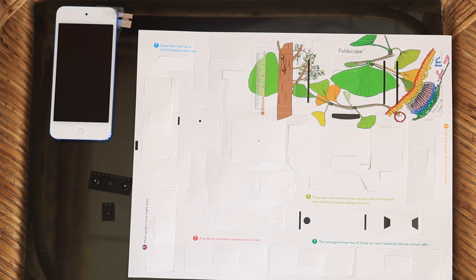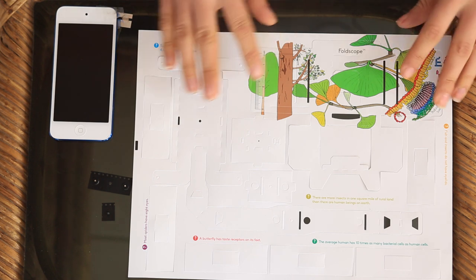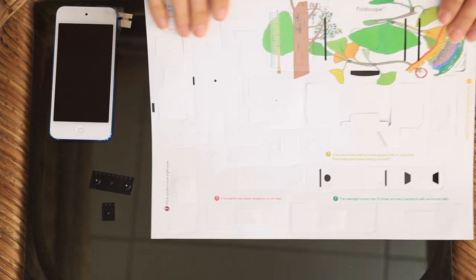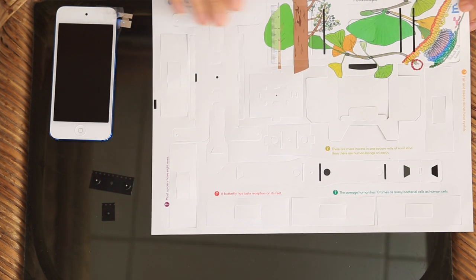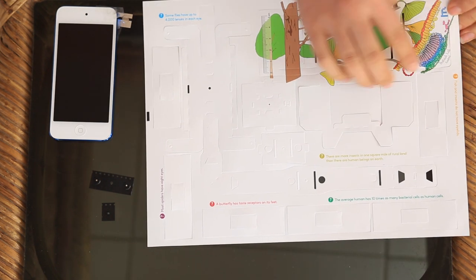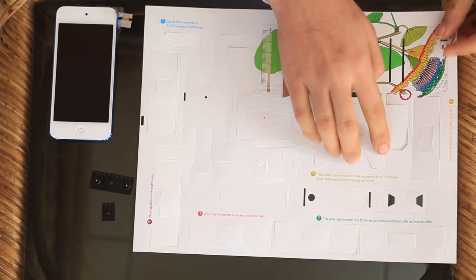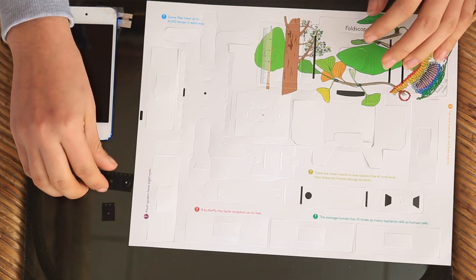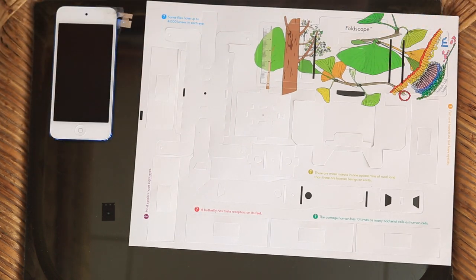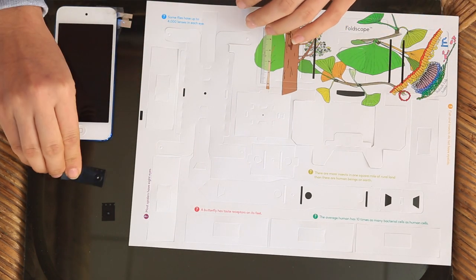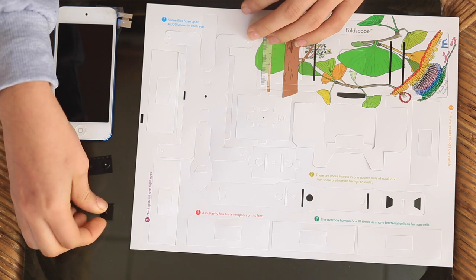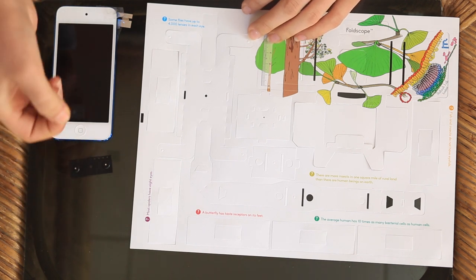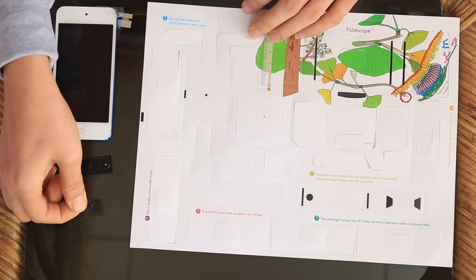A Foldscope starts off as three basic parts. You have a sheet of paper that's been cut in various ways, you have a magnetic coupler, and you have a lens, which is the most important part.